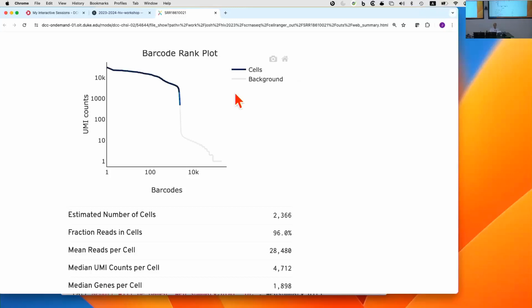Those droplets have beads but no cells, but they still can have some RNA in them because cells that get lysed before they're in a droplet, if they spontaneously lyse during processing, that RNA is going to be released into the buffer and it'll get in a droplet. You can also get sort of bogus signal. Ideally, the way the beads are designed is that if you have a droplet with no RNA in it and just a bead, you shouldn't get any signal from it. But of course, it's biology and chemistry, and so it's not perfect. If you have contaminating RNA from lysed cells, then you're going to get a signal from that.